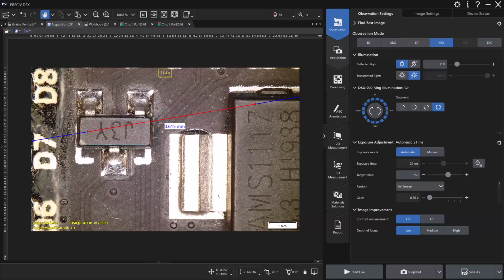You were just mentioning calibration again. We've had a whole bunch of calibration questions here, basically oriented around: is there a recommended calibration frequency, verification, that sort of stuff? Sure. So calibration frequency is very much determined by maybe a standard that you're adhering to, or an internal scope of work document or procedure internally.